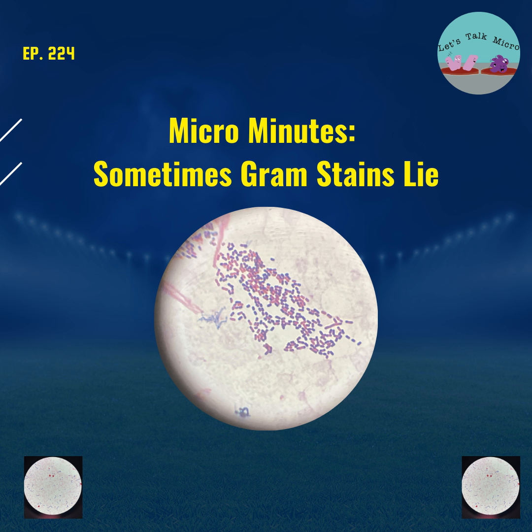You can see sometimes variable staining, and then you see the cell wall gets very elongated. Sometimes it even looks fungal-like. And you see that with gram negative rods. Sometimes after the patient has been placed on antibiotics, you see these very long rods, and sometimes they have this little circle at the center. So they definitely look very abnormal, right?